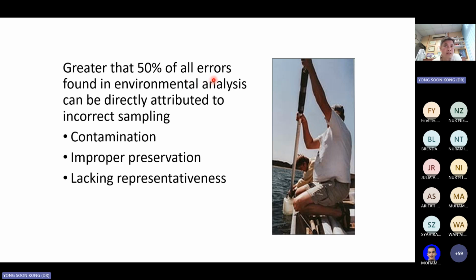Like, for example, variation due to time changes, or space changes, or the water samples may change the quality of your analyte. It's part and parcel of environmental samples. They change all the time. Okay, so in order for us to capture the accuracy of our data, we need to prepare ourselves as much as possible. We avoid contamination.